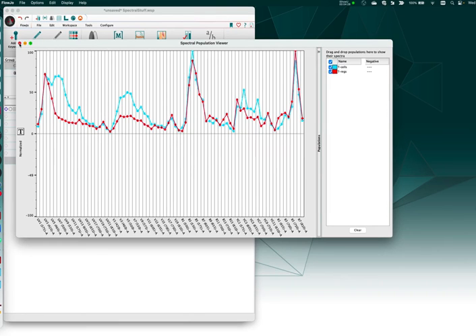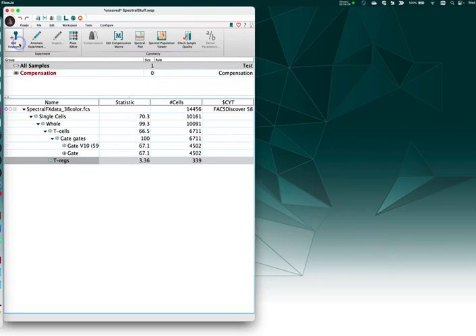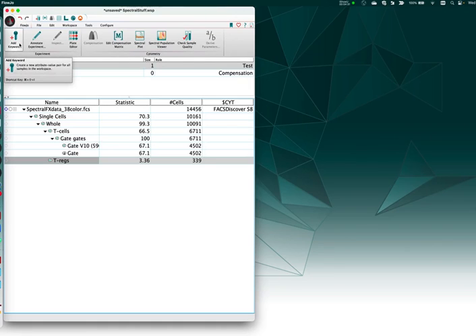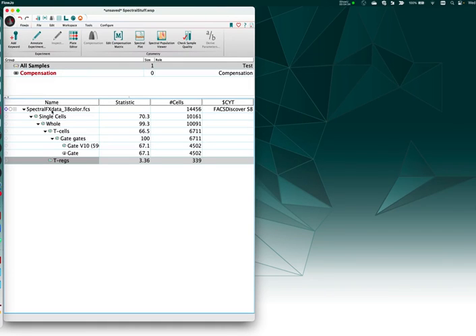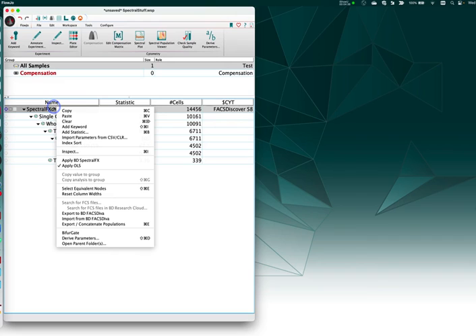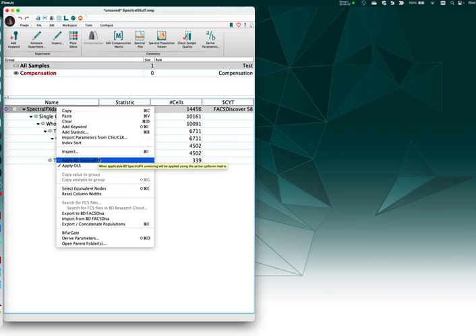One tool I will mention here briefly is just that if you have brought in spectral effects enabled data, so data off the S8, where this new proprietary unmixing technology adds keywords to the data, there is an apply BD spectral FX right-click option that you can take advantage of to apply this new kind of unmixing to the data.